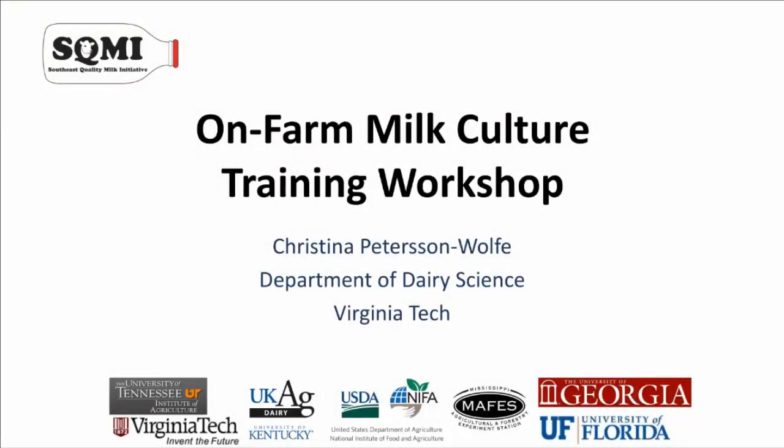Thank you. Today we are going to discuss the importance of on-farm milk culturing, and we are going to go through some of the techniques of how we on-farm culture, and then more importantly, what we do with these results once we get them.